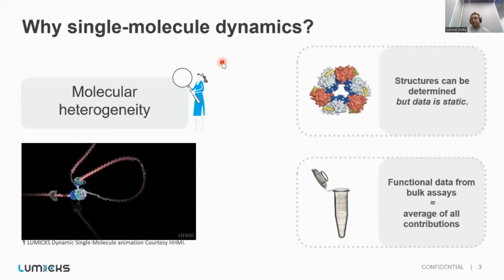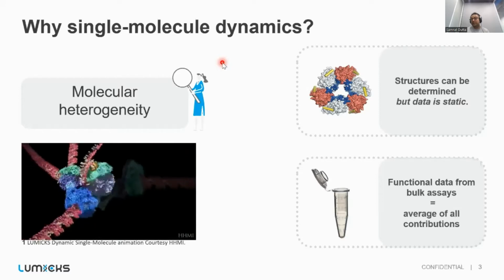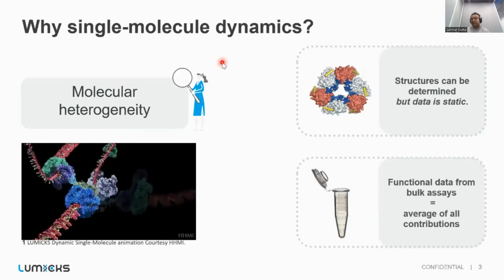And it is why it is extremely important, because there are transient states which are involved in a biological interaction, which can get averaged out in these ensemble assays, which may involve piconewton to nanometer scale interactions. And that is what I'm going to talk about today.